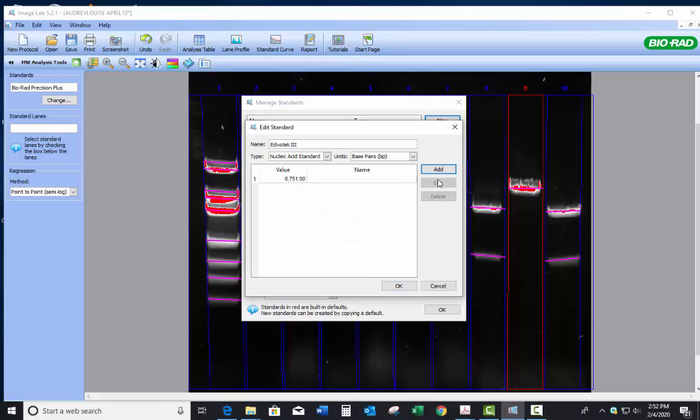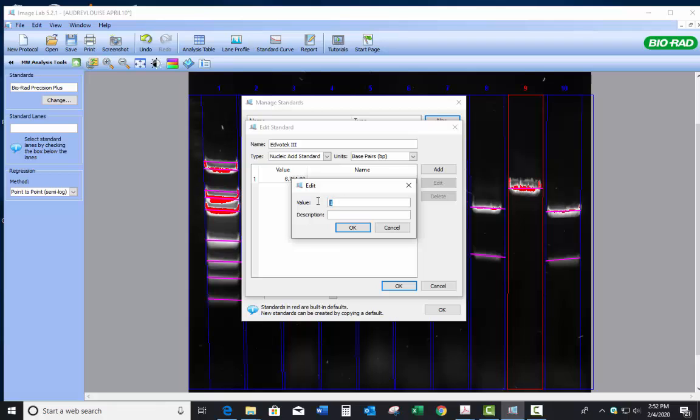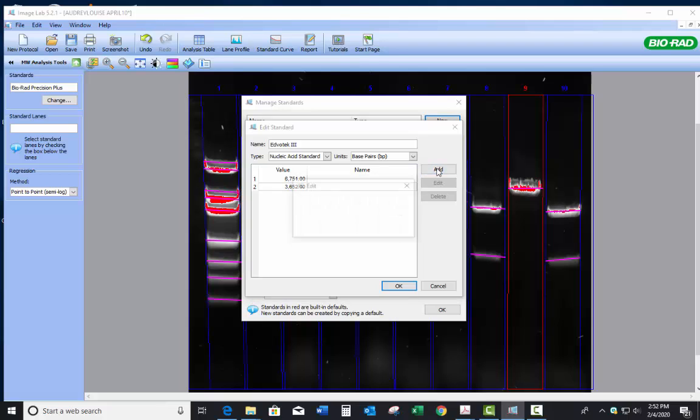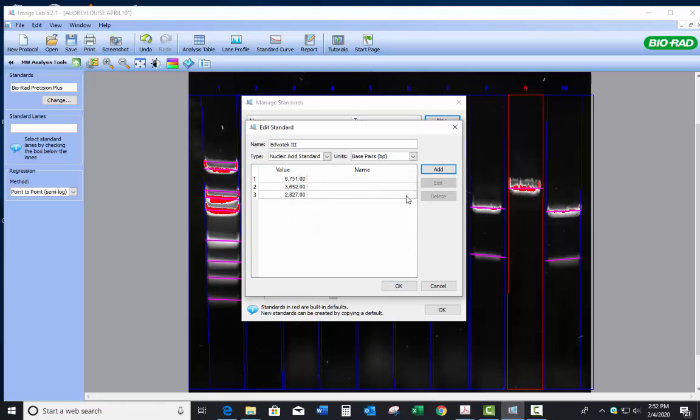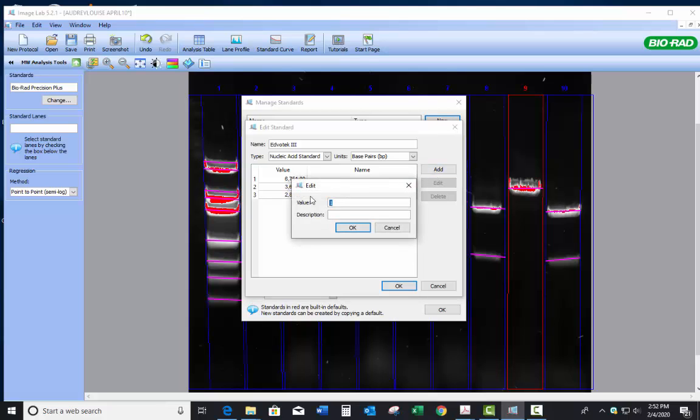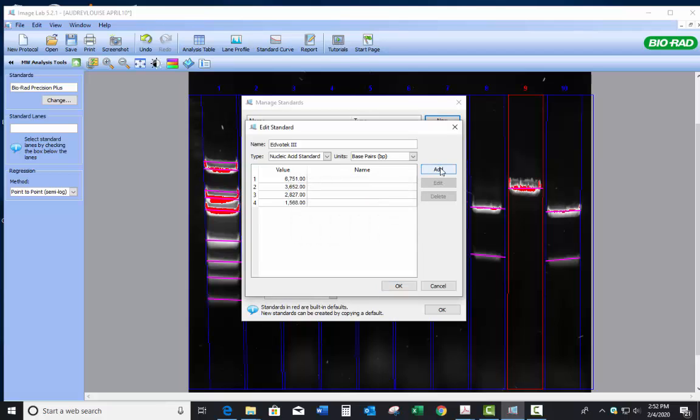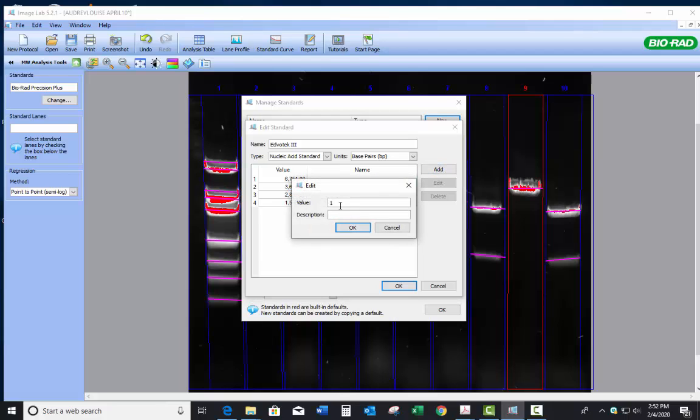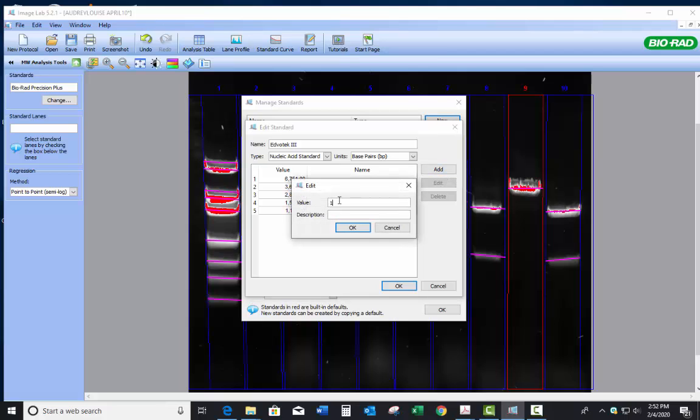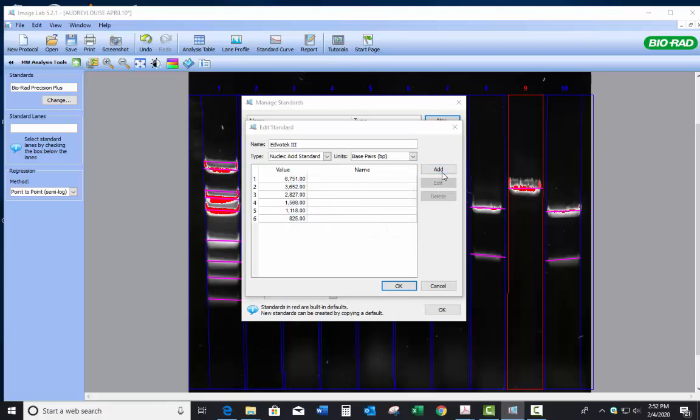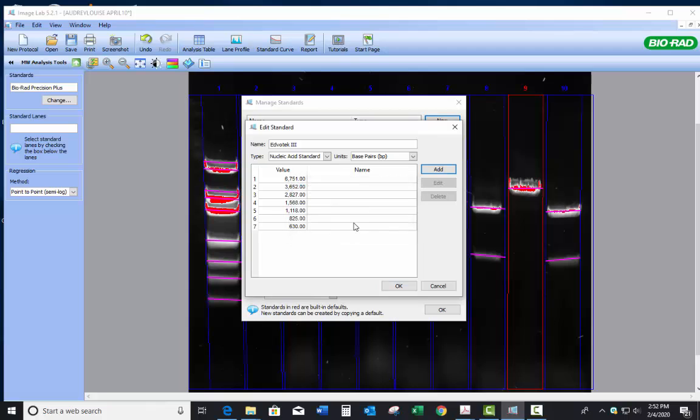Essentially what we're going to do then is hit Add. The highest base pair fragment of DNA I have in my standards that we used last year is 6751. Hit OK. I'm going to add another one. 3652. And I'm just going down the line and I'm adding all of the ladder markers. And then I just hit OK.